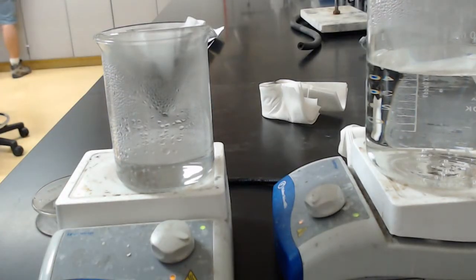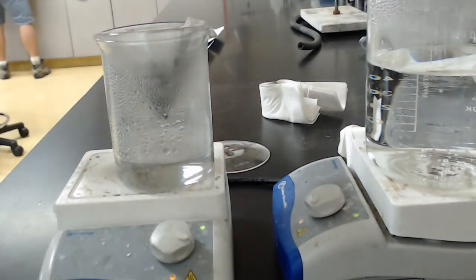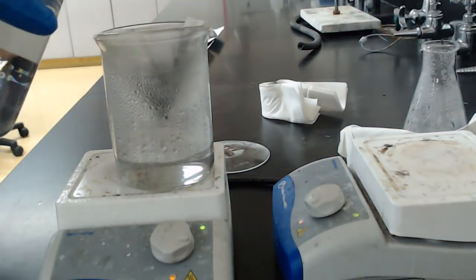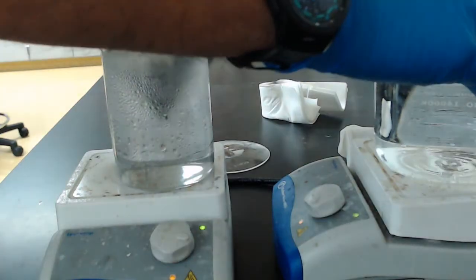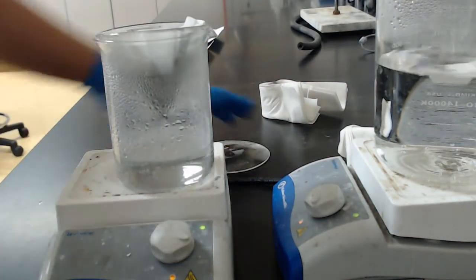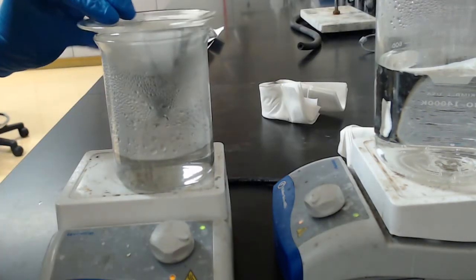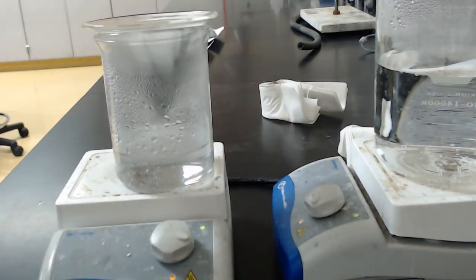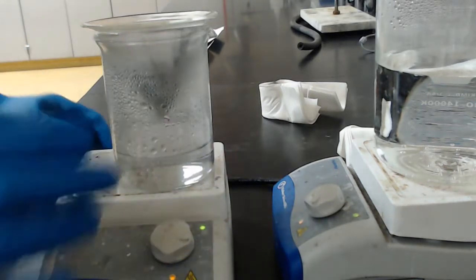The biggest part of doing recrystallization correctly is being patient. Okay. It's mostly drained now. I'm just going to go ahead and add a little bit of the hot water to it just to make sure that any crystals that are kind of hanging around the filter will pass through when they get dissolved in the hot water. I'm going to go ahead and take this off the heat now. You don't want to throw it straight into the ice. You want to make sure that you give it a chance to naturally cool off on its own on the bench top.